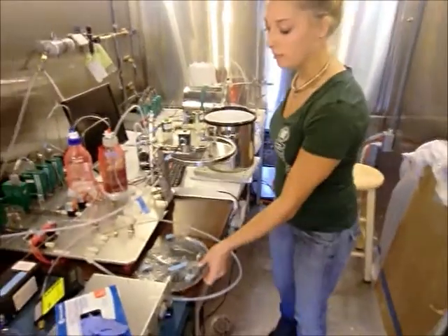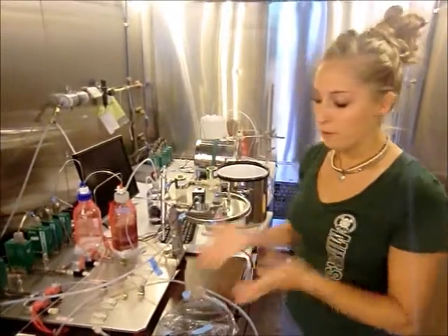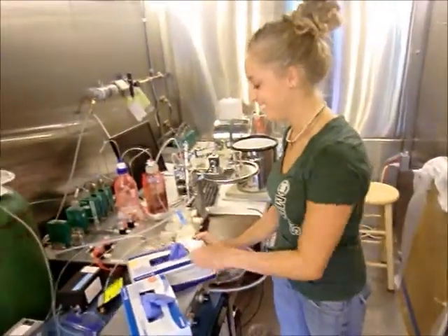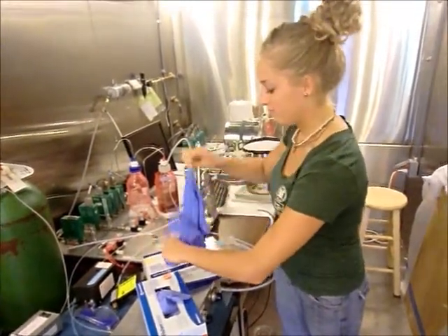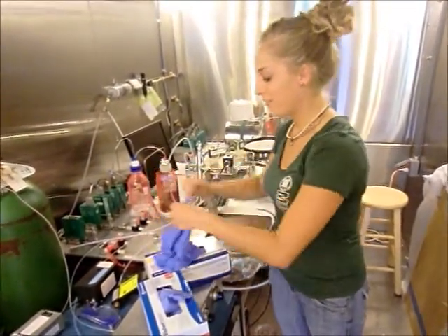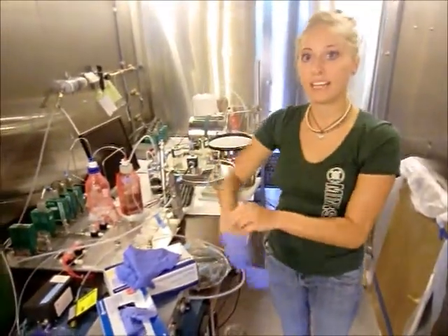And we'll run a carpet sample that has been tested and run. But before I would actually take it out, I'd put gloves on. It's important not to touch the majority of the glove with your hands, because skin oil is highly reactive with the ozone.